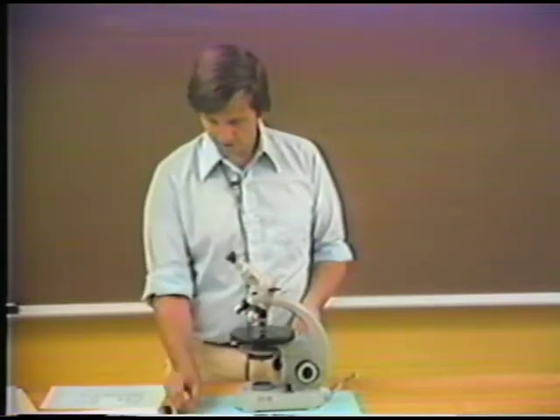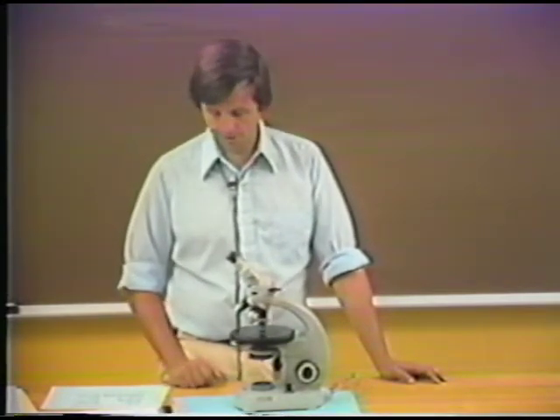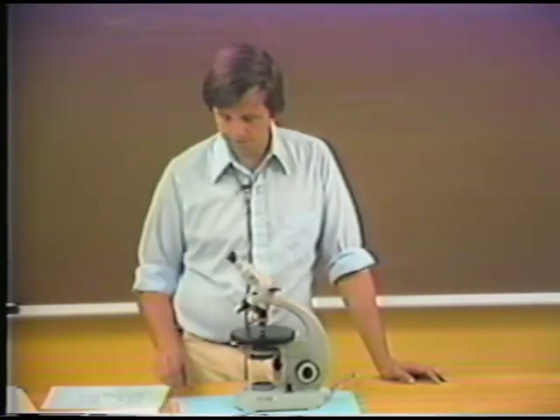The mineral quartz then observed in an uncentered optic axis figure and the determination of the sign of the mineral. But we can also get the sign of the mineral. And of course there are two possibilities, a positive or negative sign, and this we can use as an identification criteria. So we want to know the sign of particular uniaxial minerals.